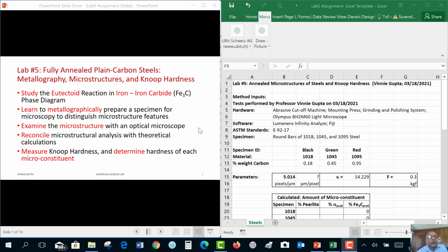I want to make sure in this video that you know what you need to do for lab number 5. So here was our big picture. In the first video, I showed you the microstructures that result from eutectoid reaction. In the second video, you saw how the specimens were prepared. And then in the third video, I worked with the demo specimens.